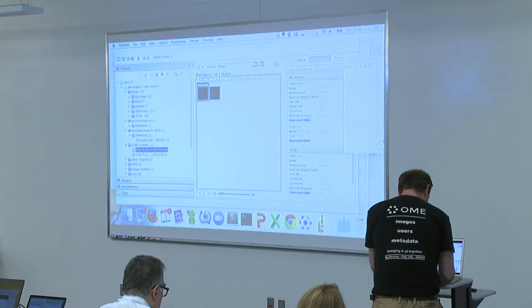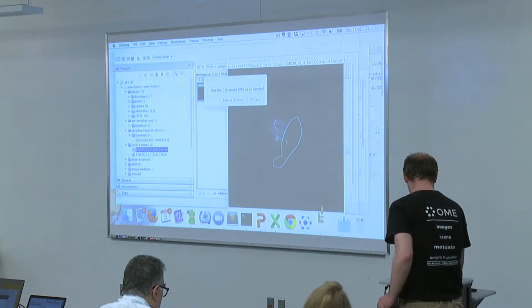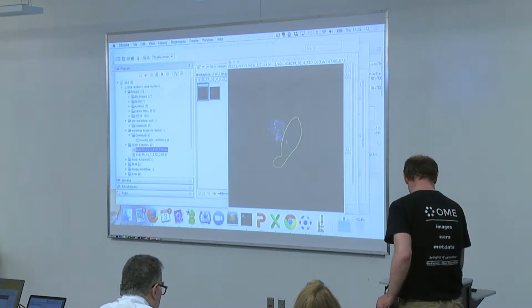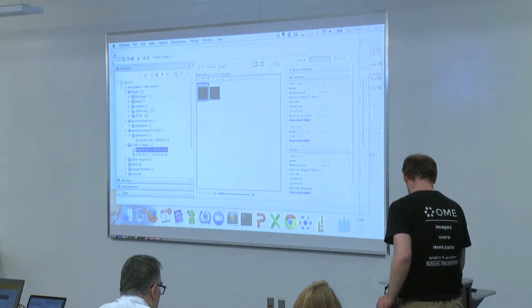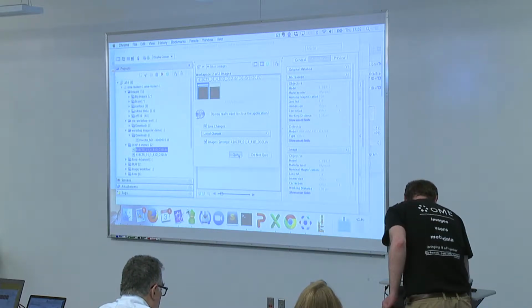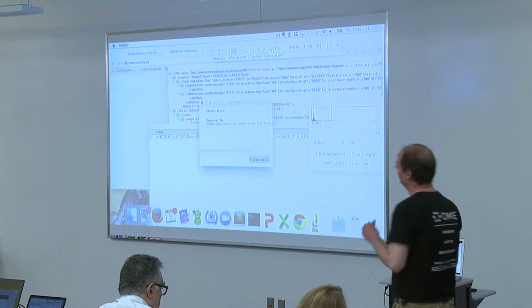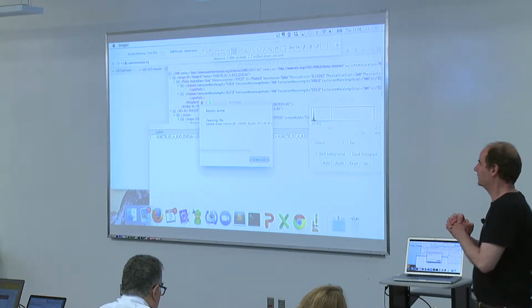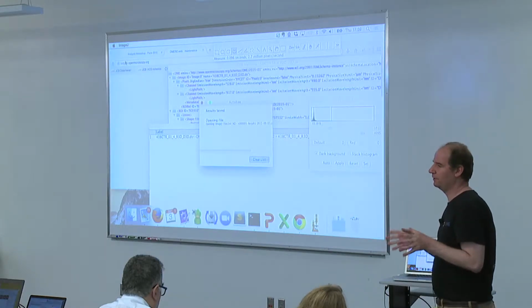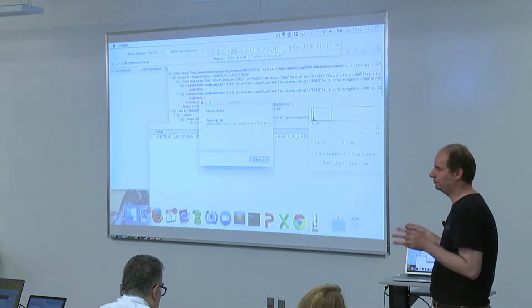You basically can combine Micro-Manager and MATLAB and ImageJ, obviously, in such a manner that you can acquire the images using Micro-Manager on your microscope and immediately store them in OMERO. Okay, this would be one part.